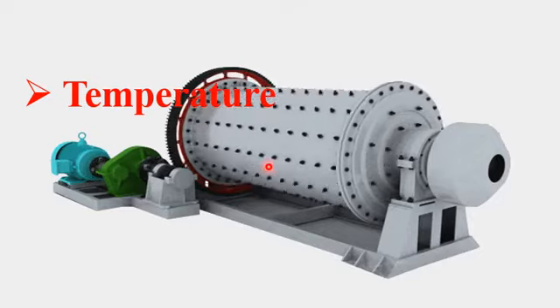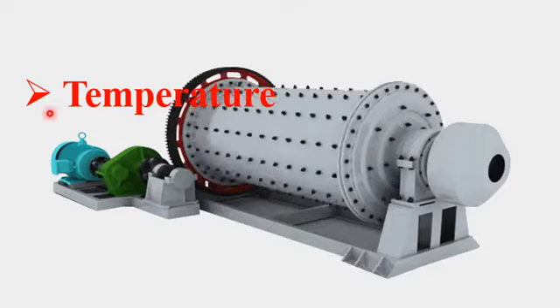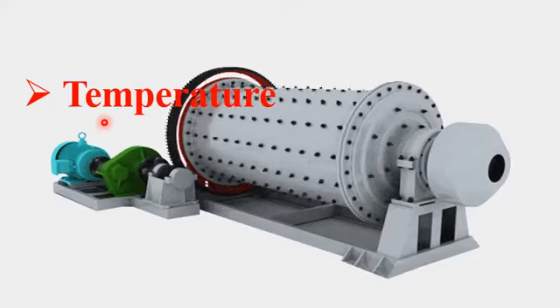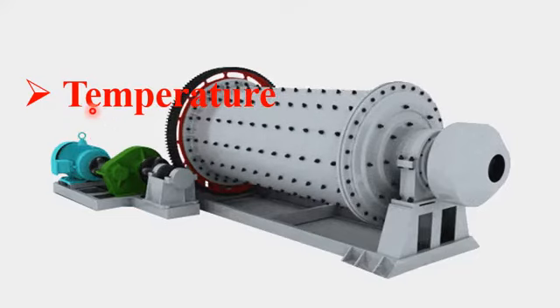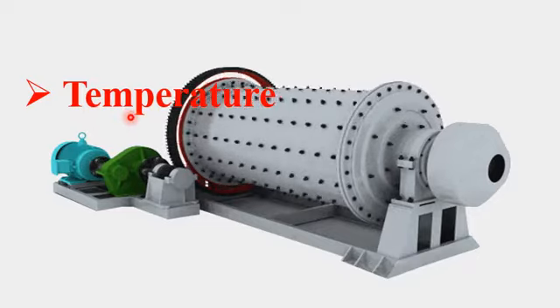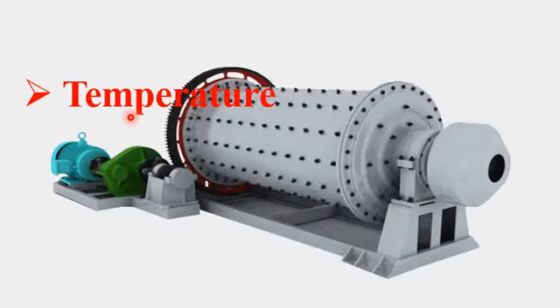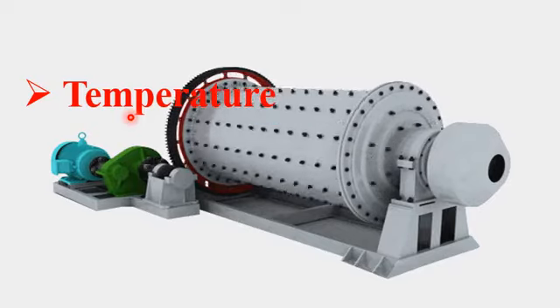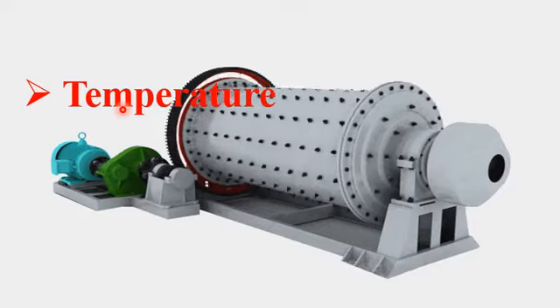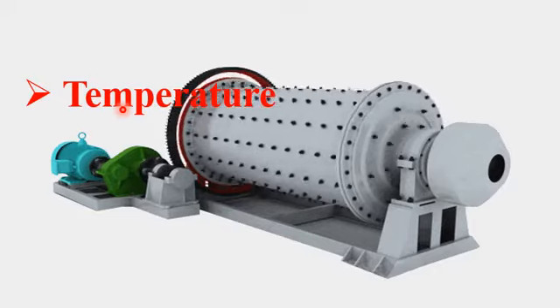And student, please also note that the milling temperature will seriously affect the result if we are using a bulk material which is in the form of a composite or a ceramic. Basically they are very hard, and due to the hardness of this material there is a possibility of structural defects and damage due to temperature. The temperature may create a lot of structural issues in such particles.